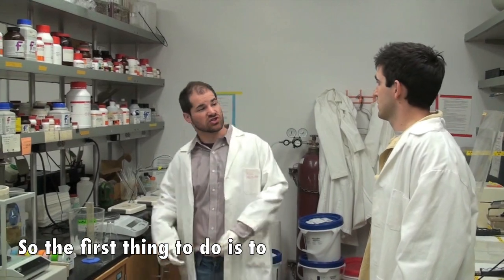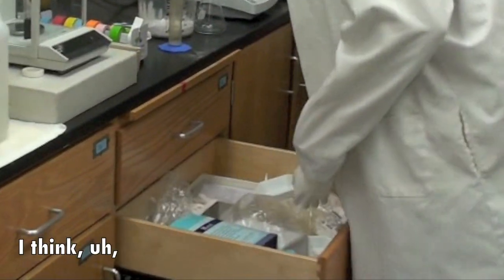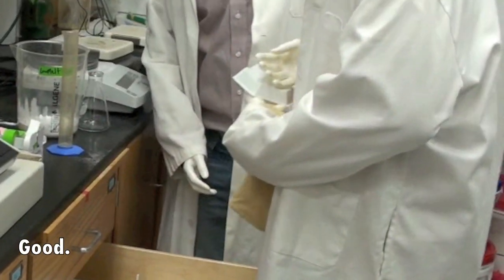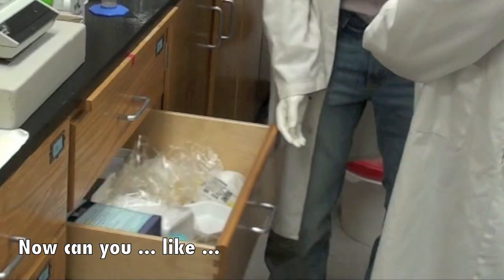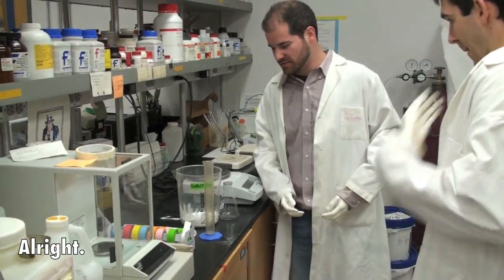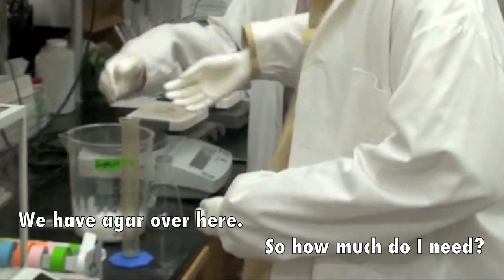Yeah. So the first thing to do is to just grab a weigh boat out of the drawer. They're right here. Okay. I think, just try to get two hands on it. Good. Okay. Now, can you, forget about the weigh boat. All right. Okay. We can do this the old-fashioned way, you know? You just use the scale. So yeah, how much agarose here?